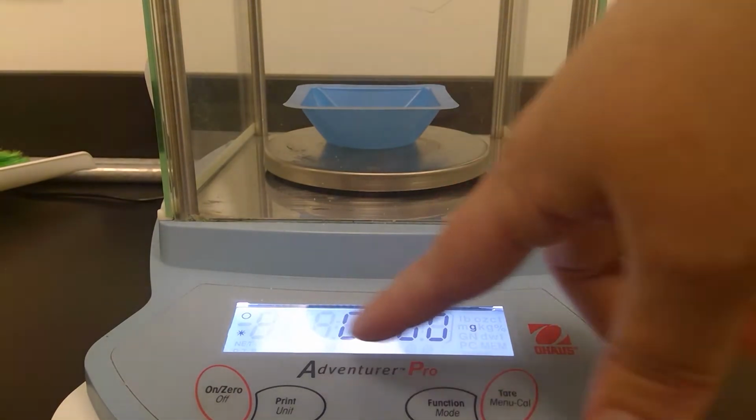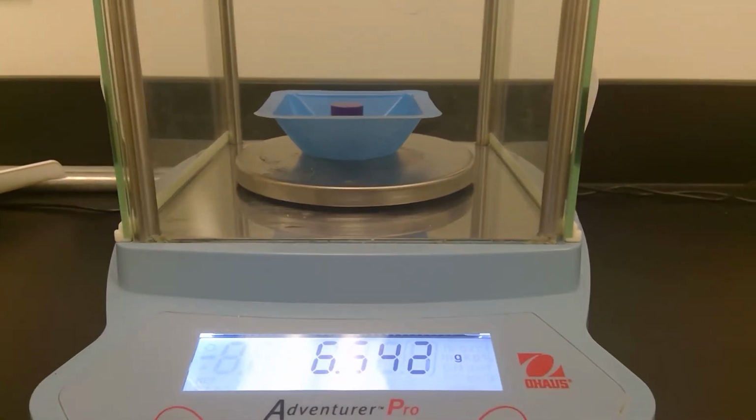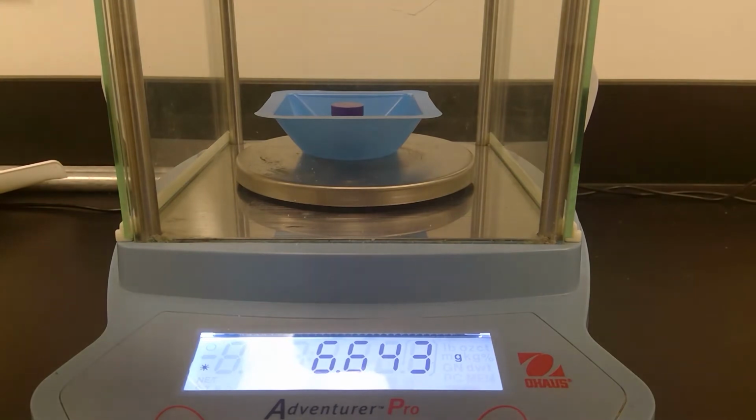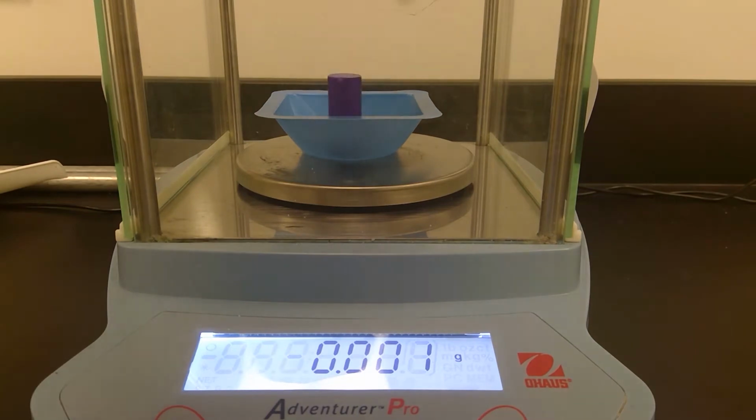So you'll want to make sure it's tared. It says 0. So that's the mass of the first one. So record your data. Here's the mass of the second one.